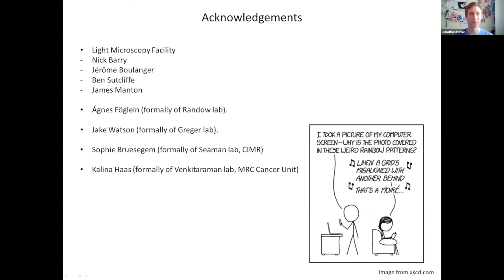So SIM is not that much different to using a regular wide field microscope, and for STED, you have to take great care in how you prepare the sample, and there's more parameters in the software that you can adjust. But normally people don't have too much problem.